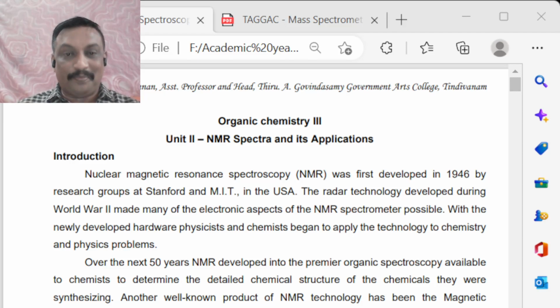I am very happy to introduce NMR spectroscopy to the chemistry students. NMR spectroscopy is a very important technique utilized for establishing the structural elucidation of organic compounds. Not only organic compounds, some inorganic compounds can also be structurally established using the NMR technique.